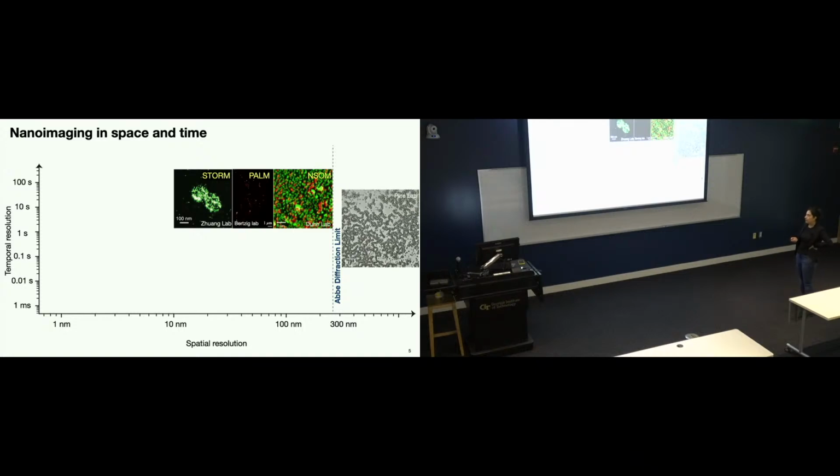What would ideally work for us in terms of the spatial resolution we are looking for is something that works with the electron beam, because easily it can give you that spatial resolution. But the challenge in using TEMs for looking at nanostructured systems is that if you are interested in dynamics like me, then if you do normal TEM, you're drying your sample overnight, so there's no dynamics in that. And if you're doing cryo-TEM, then you're vitrifying your solution. Again, there's only one static image. So how can we really use TEM to look at the dynamic phenomena at the nanoscale?